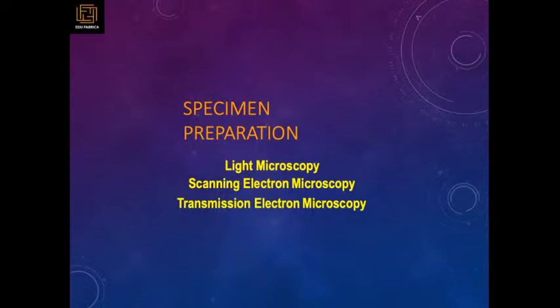This is the specimen preparation for light microscopy, scanning electron microscopy, and transmission electron microscopy. How you can prepare your specimens in that.